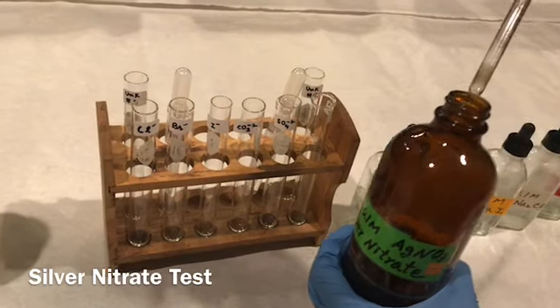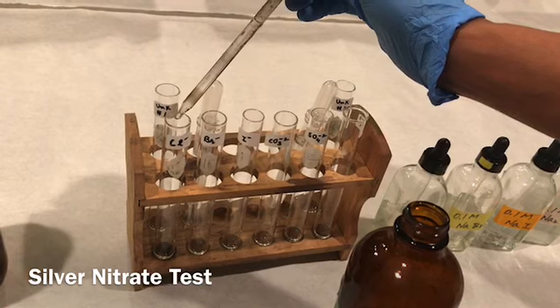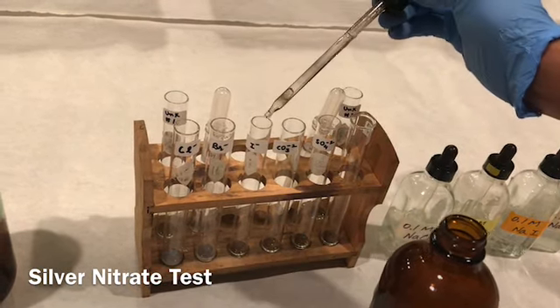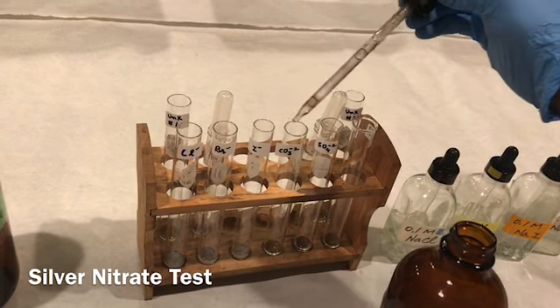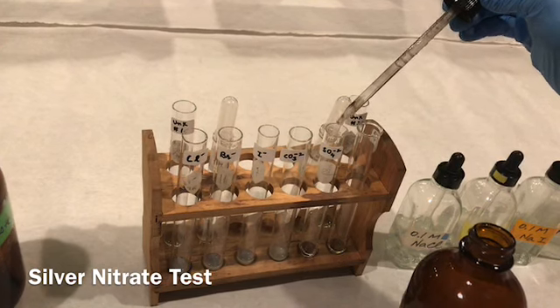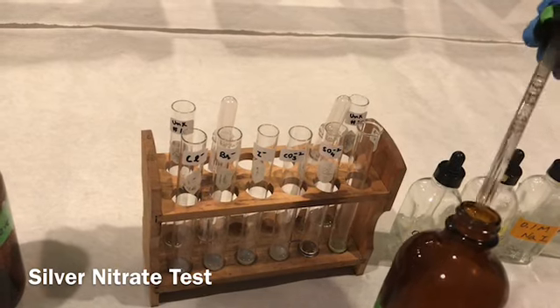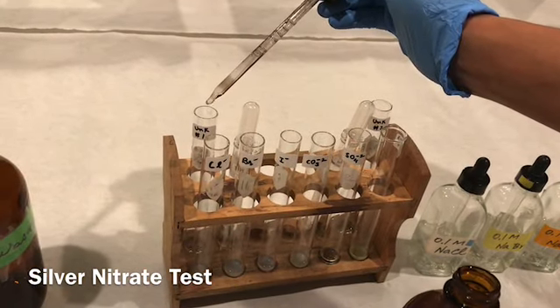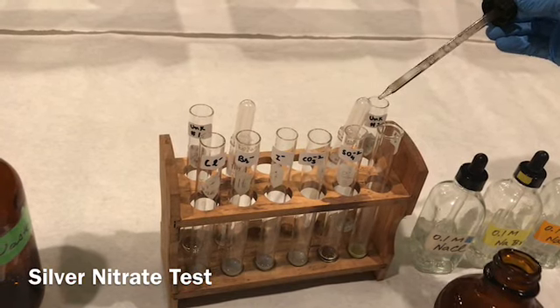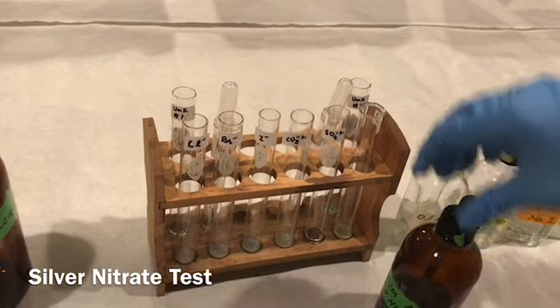Now I'm going to add silver nitrate in every test tube. Okay, now after that you are supposed to record the observations.